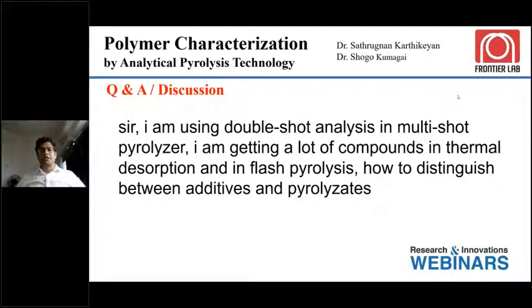Okay, generally it's very difficult to answer in a generic way, because we have to see what your analysis and analytical conditions are, since additives generally should come before the flash pyrolysis temperature. First question I may ask: have you used the EGA to set your thermal desorption and pyrolysis temperature? I think you may have to drop an email with more details, then we can really interact on that.